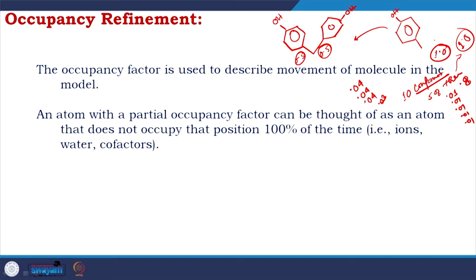So, you would be benefited to know the contribution of all conformations, because some of the conformations which are not contributing to higher stability might play an important role in the development of the transition state, intermediates and things like that.